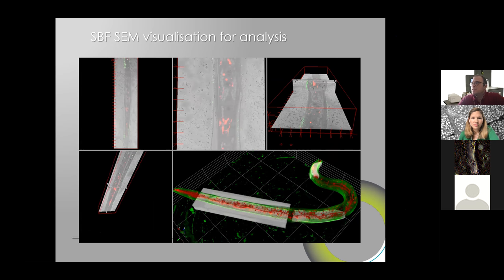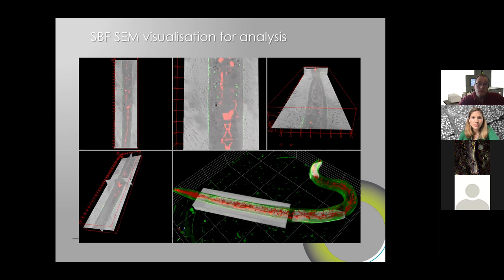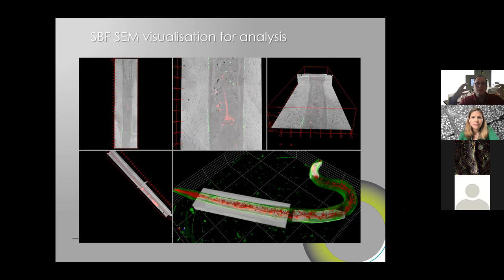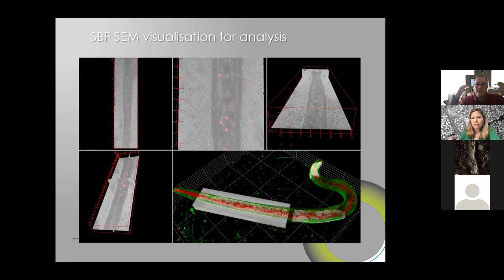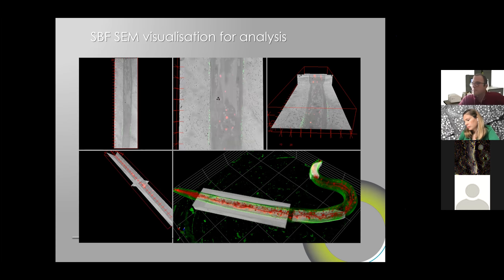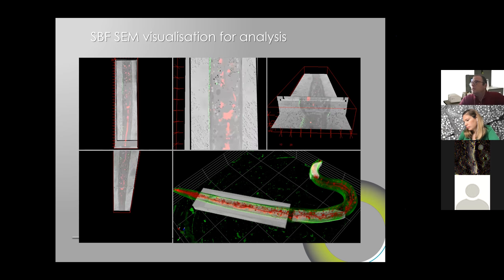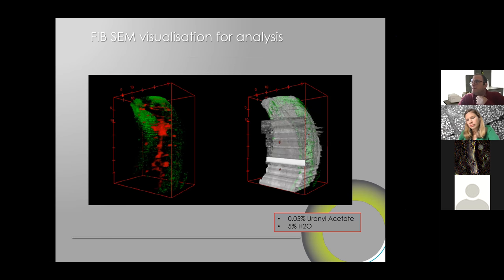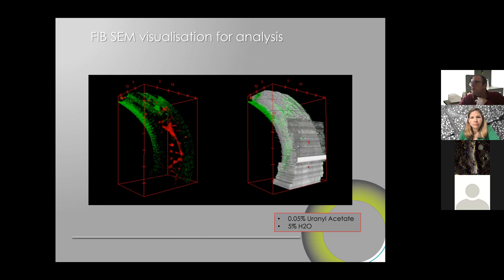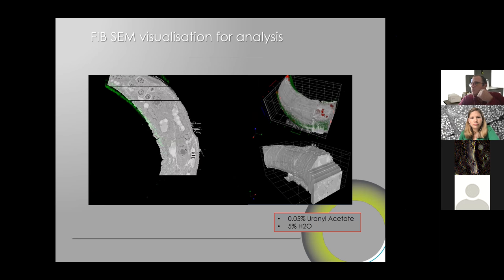As you can see, the matching is quite good, and this is expected in a way, simply because we're looking at the same volume, both in light microscopy and in electron microscopy. Since we're always looking at the block and not at the sections, we're looking at unaltered structures. So the matching is ideal, if not to say optimal. This is a side effect, but quite an interesting one. So that's the way we did it. That's the visualization, and all of this combining was done with vCLEM. So I let you appreciate the final images.